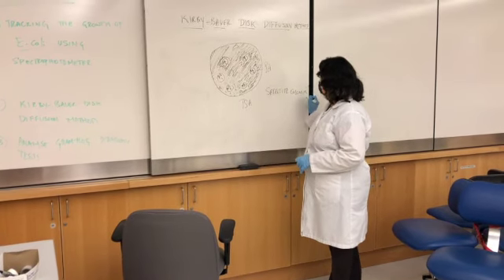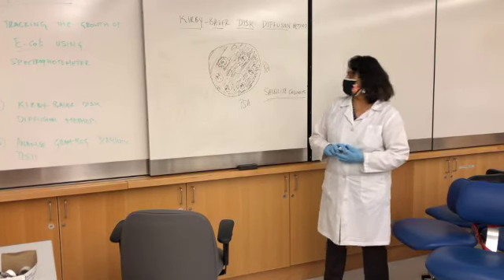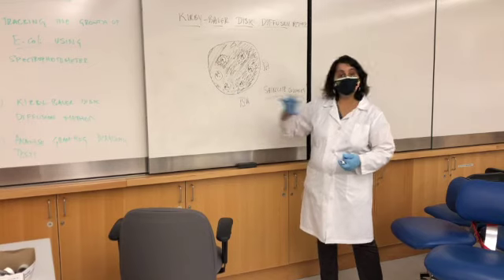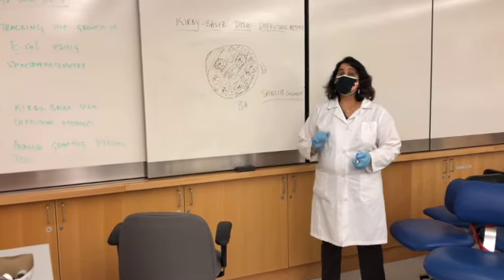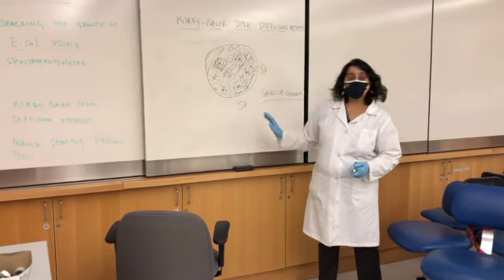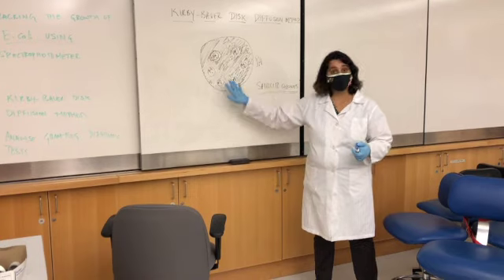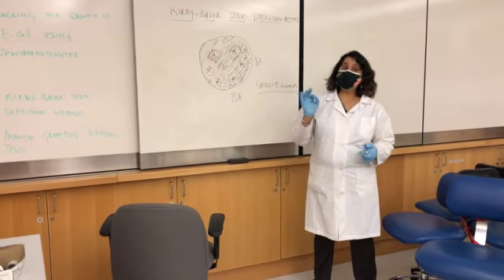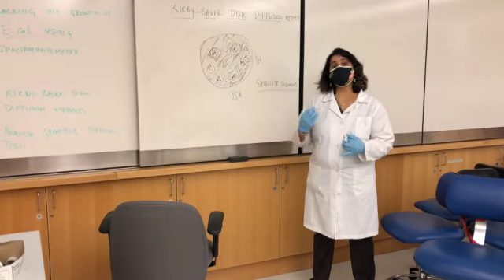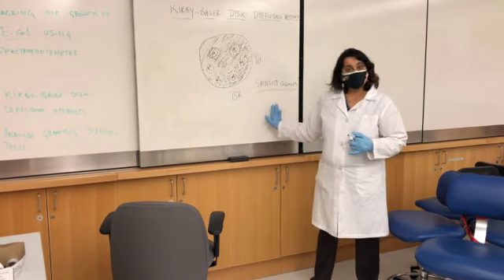Can you think what these satellite colonies could be? So the tiny bacterial colonies that are growing inside the zone of clearance, they are the resistant colonies. The bacteria probably is not resistant, but it is sensitive to the specific antibiotic, but there are some bacterial cells that would develop resistance to that antibiotic. So those are known as satellite colonies.